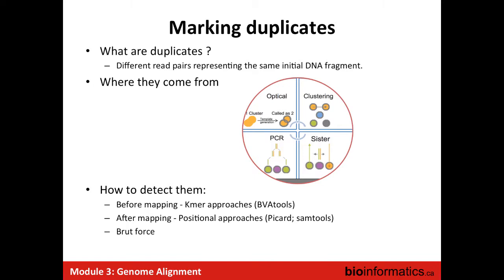And so what I'm wondering is, if you have duplicate reads, the same way that you would with an overlap, where you would increase your confidence, rather than taking your most confident scores, can you not sum the agreement and then subtract the disagreement to give you a more confident answer for that particular fragment?